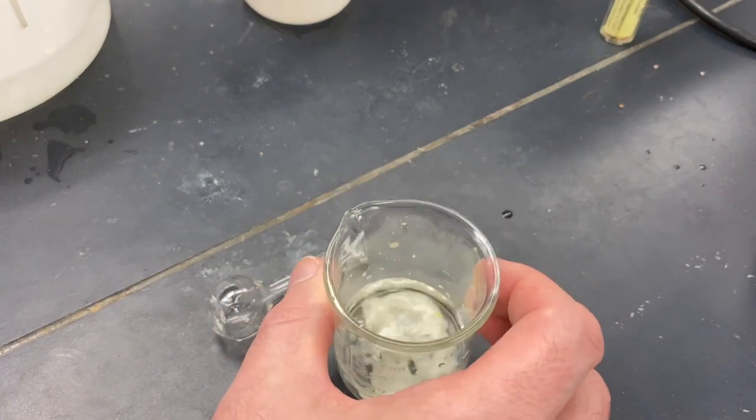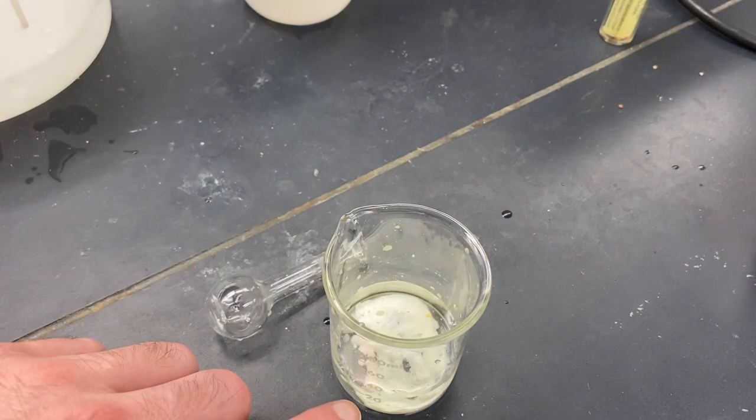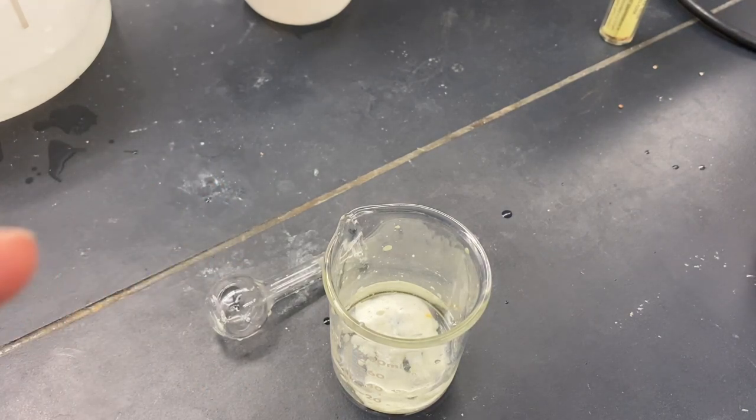So this is helping to dilute our sulfuric acid. We'll be able to wash that away. Now we're going to prepare a Buchner funnel and filter this. And then we will wash it.